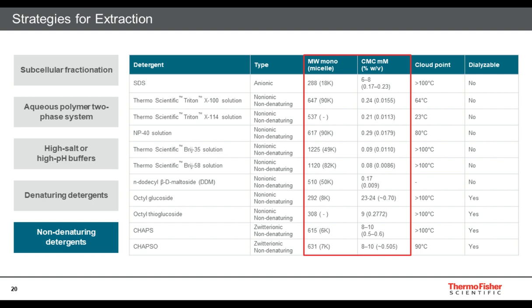For these reasons, we decided to focus on detergent extraction. Like the components of biological membranes, detergents have both hydrophobic associating properties and polar head groups that allow the dispersion of hydrophobic compounds into solution. At high concentrations, detergent monomers aggregate into structures called micelles. Working at or above the critical micelle concentration, or CMC, promotes detergent monomers to form colloidal aggregates or micelles that can sequester hydrophobic membrane proteins into their structures, effectively keeping them in solution.